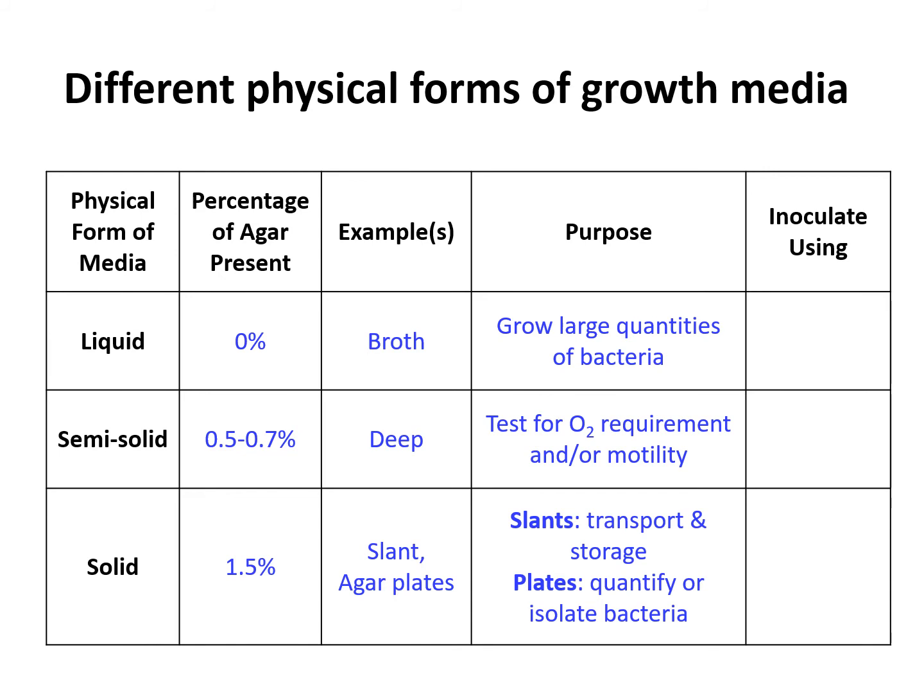I want to transport my bacteria in between labs. So it's best to transport your bacteria using the slants. Slants are also good for storing your bacteria.